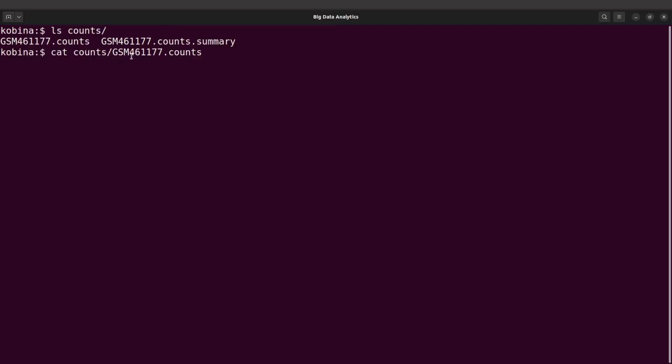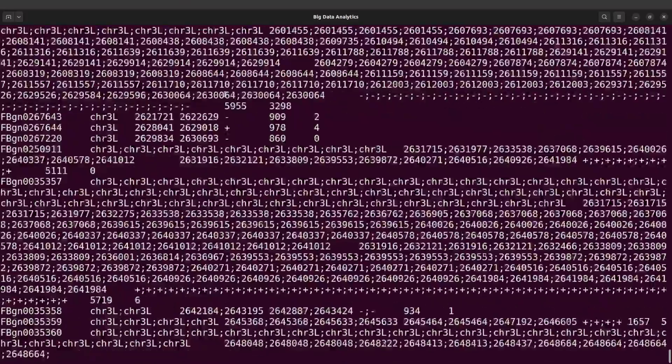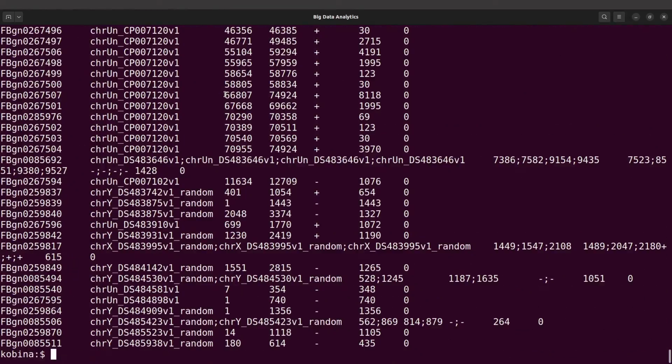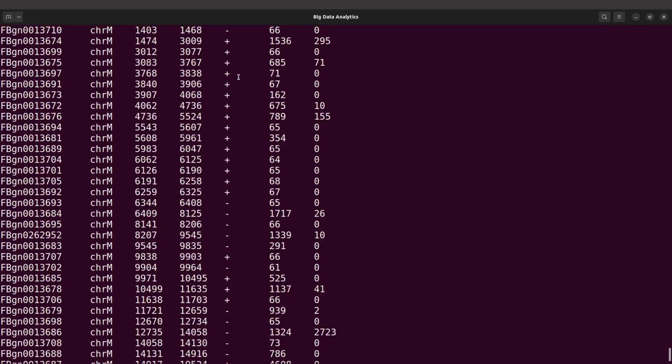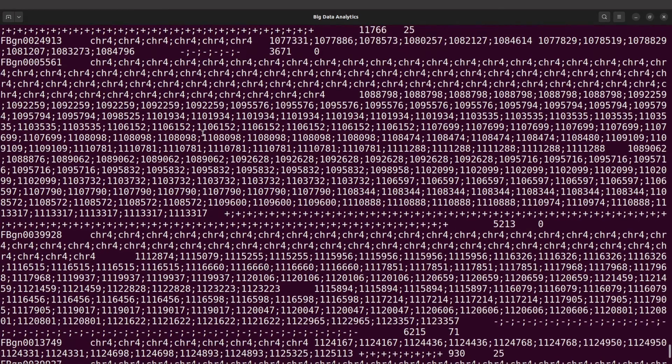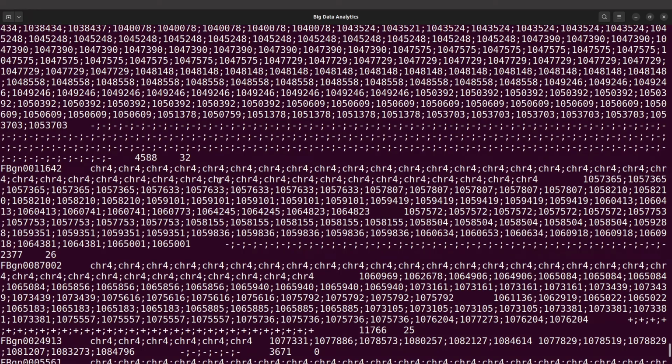This will give you everything here, so you have lots of information. It tells you the count. There is other information here, so I will leave the documentation to featureCounts so that you can read more about the outputs, but we are going to explain them later on.